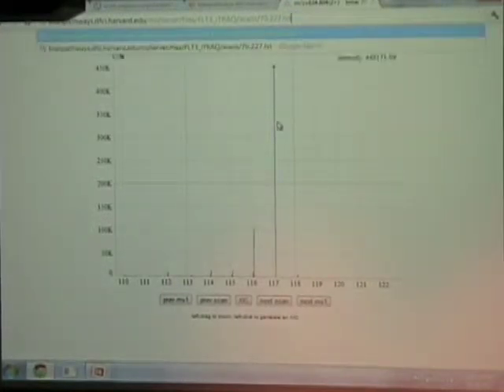This is what I wanted to show you, that you can browse this data. Let's say you're reviewing a paper and you want to second guess the author. You can go into the spectrum and take a look in detail. You can pull out a text representation, so you have actually all the numbers, everything you need to look very carefully at the data.